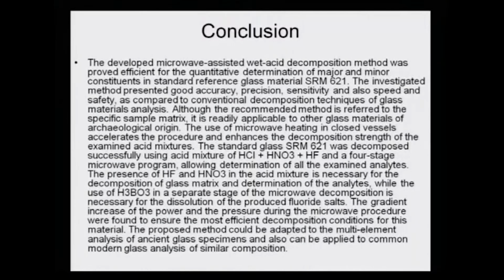The gradient increase of the power and the pressure during the microwave procedure were found to ensure the most efficient decomposition conditions for this material. The proposed method could be adapted for a multi-element analysis of ancient glass specimens and also can be applied to common modern glass analysis of similar composition. So, it is a method which has been found to be foolproof for all types of glass samples.